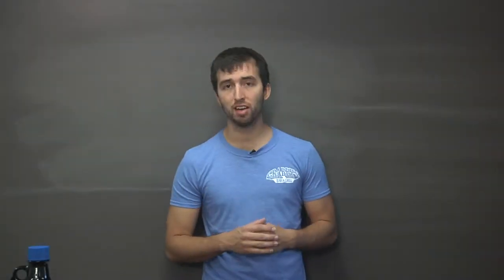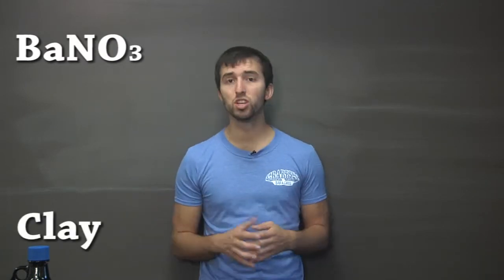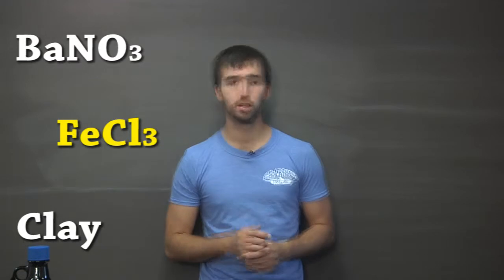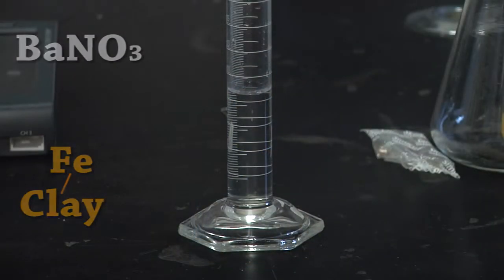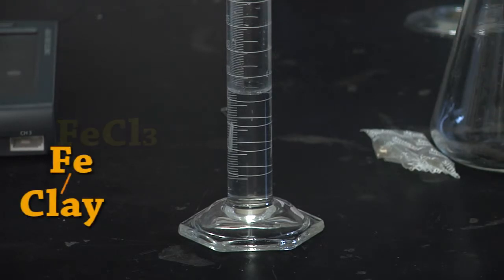Now all we should have left in solution is barium nitrate and clay. To help remove the clay, we will use iron chloride. The iron molecules will help remove the clay from solution. We are going to use approximately one milliliter of iron chloride to precipitate our clay. The positively charged iron molecules will react with the negatively charged clay to help remove it from solution.